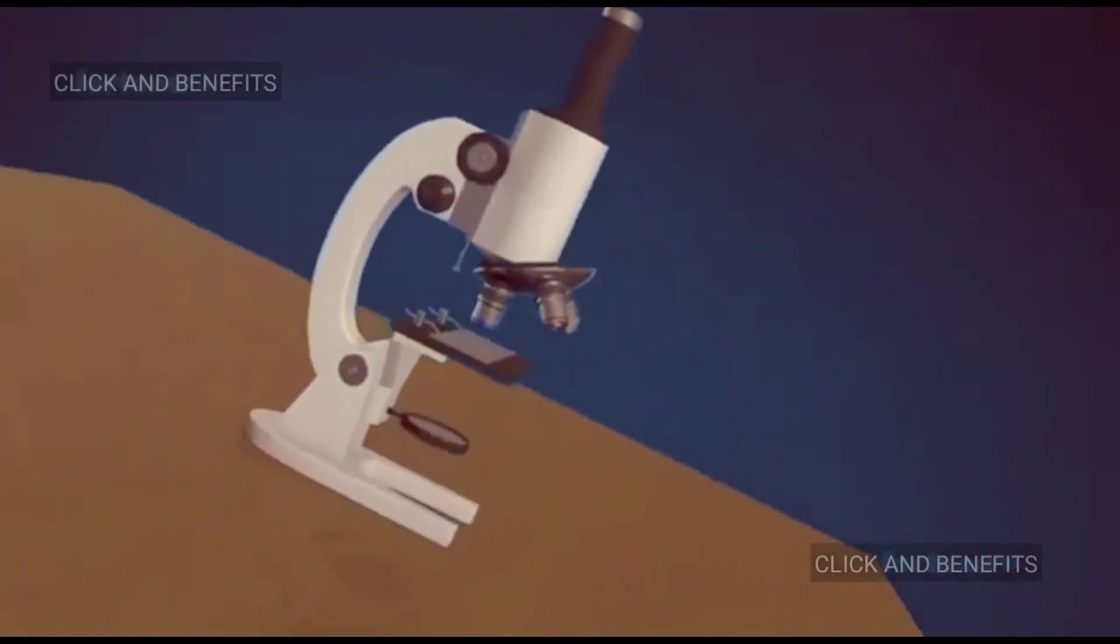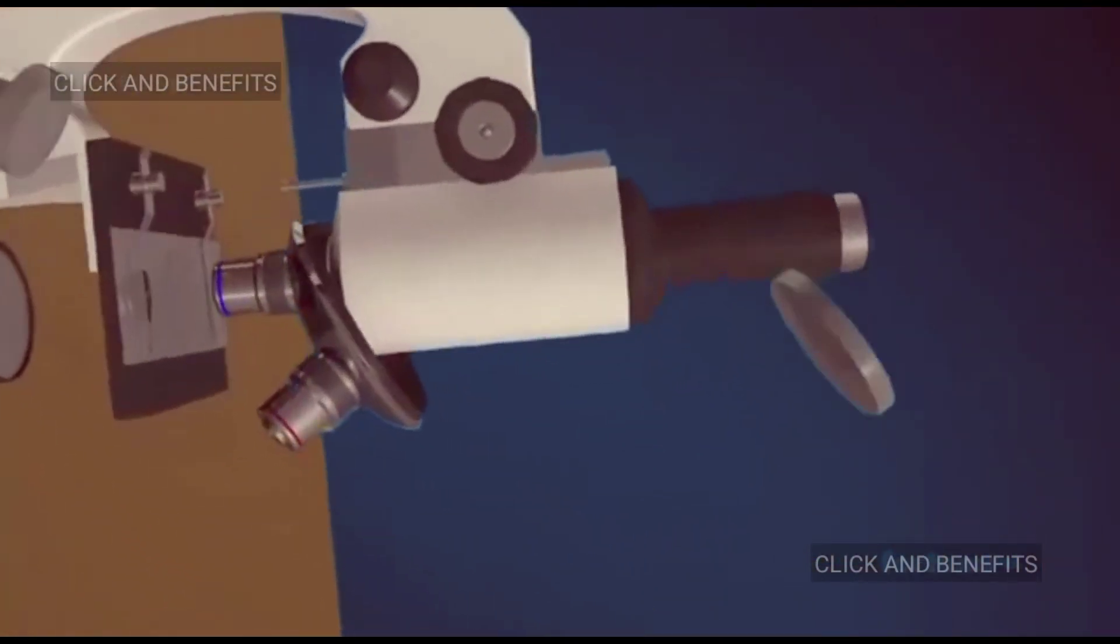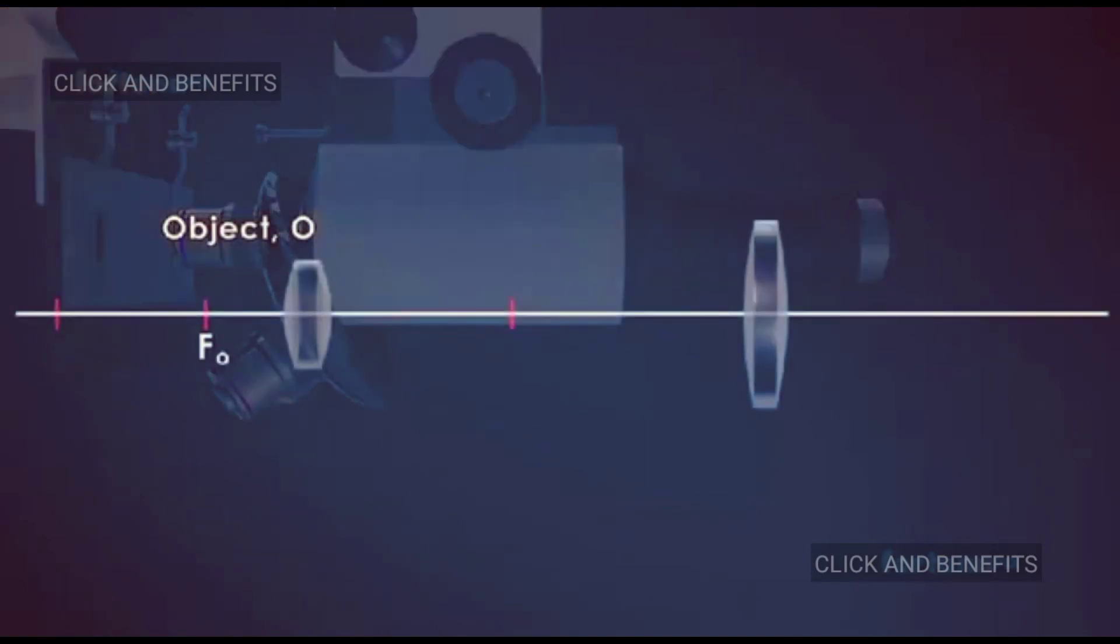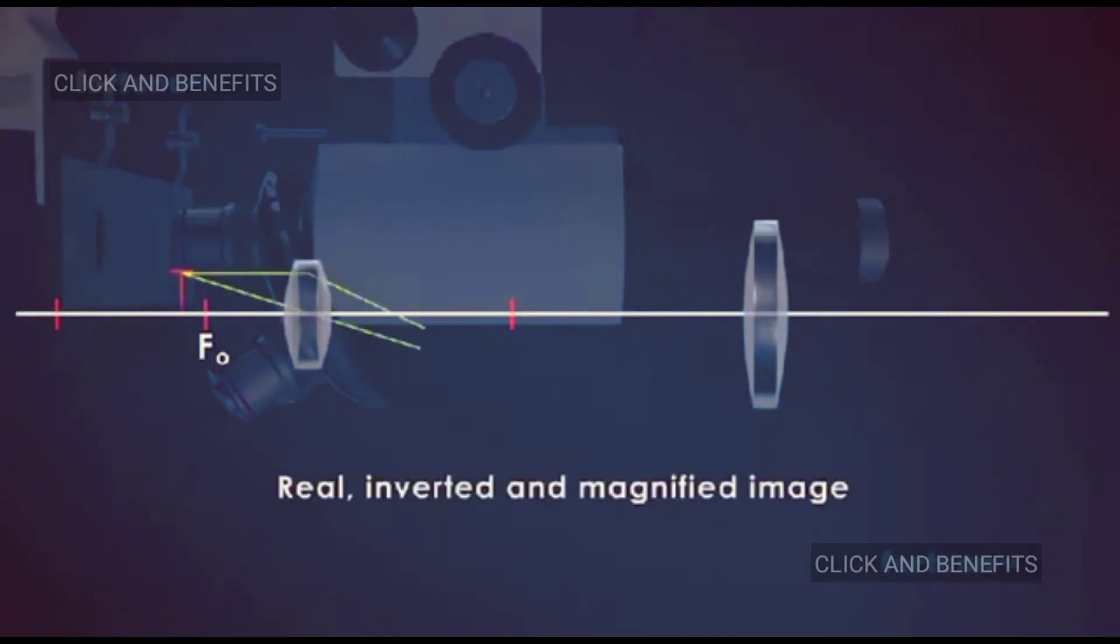Working of the compound microscope: The object o is placed just outside fo, the focus of the objective lens. A real, inverted, and magnified image i1 is formed. The magnified image i1 acts as an object for the eye lens.